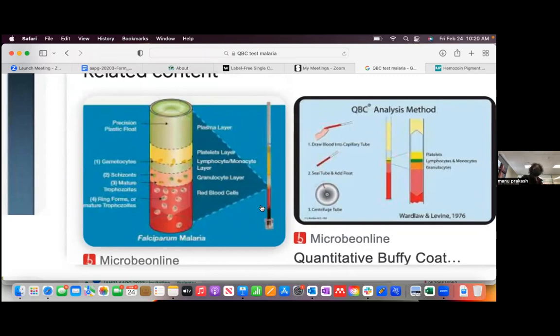Once that happens, you don't have to search everywhere, which is what we are doing with Octopi, right? We looked at the malaria smears early on, where a user sitting at a microscope searches everywhere. You have to look at every cell to see whether it's malaria or not. Here, you're doing a density separation.